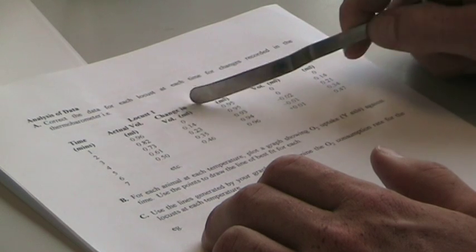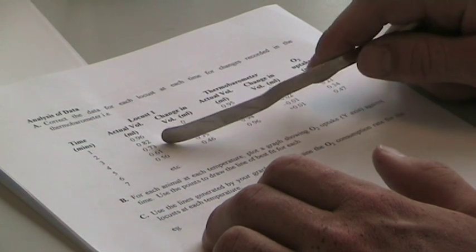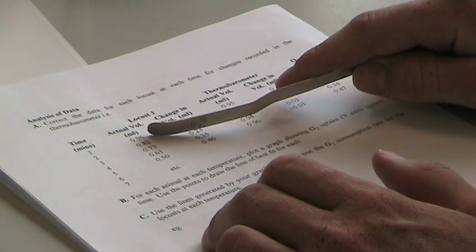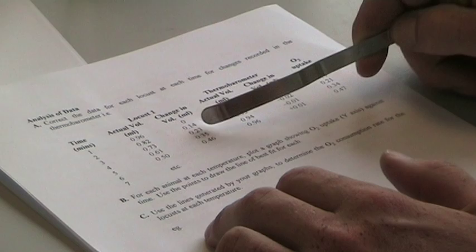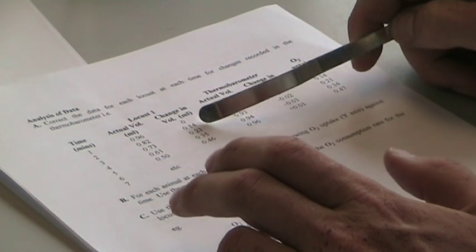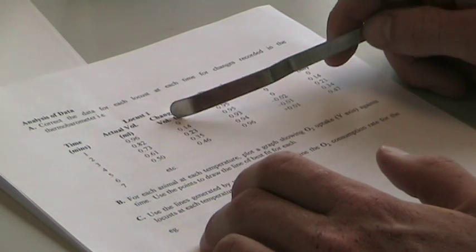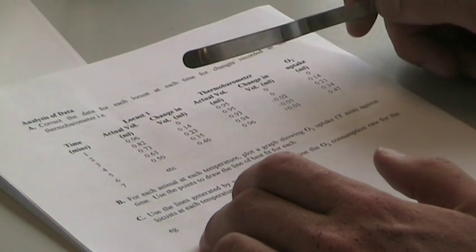Here, for change in volume, you would subtract the given value, in this case 0.73, from the original value, 0.96, giving you 0.23. It's an approximation of the O2 uptake from the locust.